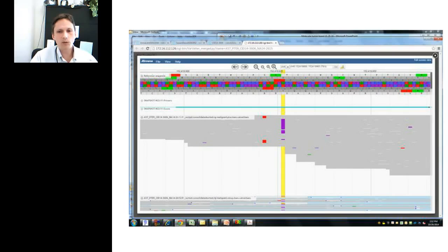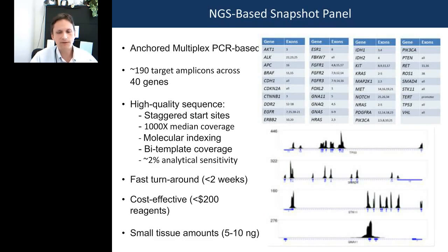And here in purple, we likely also only have 2 reads, even though probably 20 to 30% of the total reads in this call were mutant. It really is probably just 1 or 2 original template molecules. So when we see stuff like this, we get very concerned and are very careful in our interpretation of the data. So that's a general background into how AMP works and how we utilized some of the error correction and complexity information.